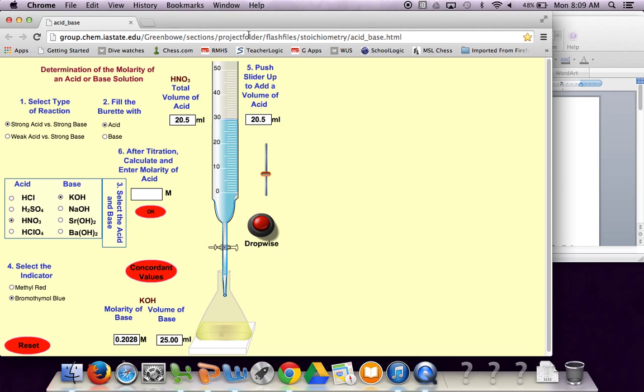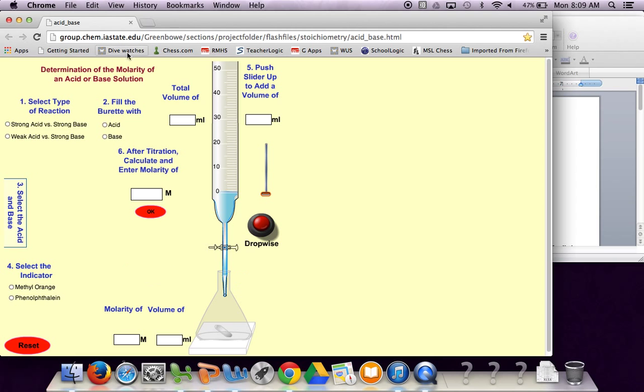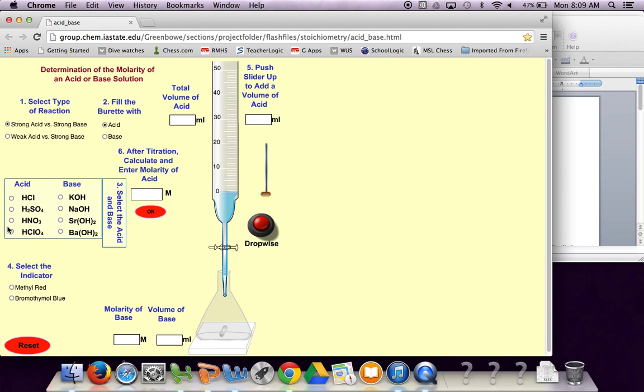You're going to have to reset everything and remember strong acid. Our acid is going to be nitric acid and KOH for our base potassium hydroxide. I'm just going to really quickly redo things and add the same conditions.